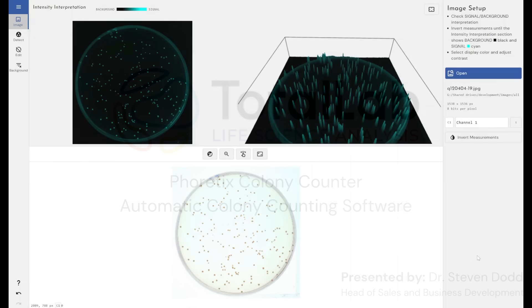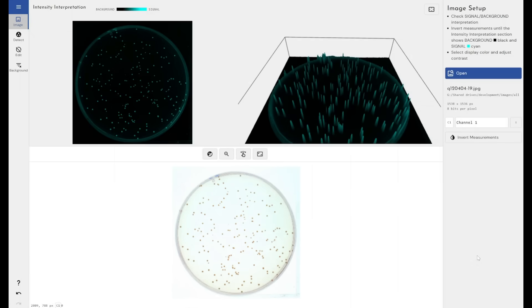This is the new Phoretix Colony Counter software from TotalLab. This software is designed to not only count colonies within an image, but also to count number of cells in a cell viability assay sample.